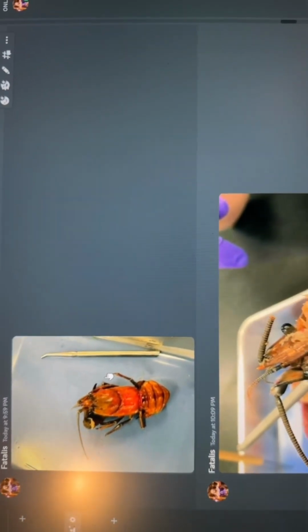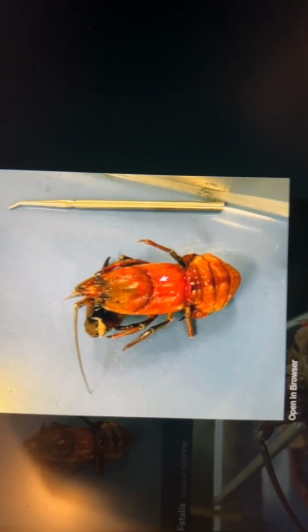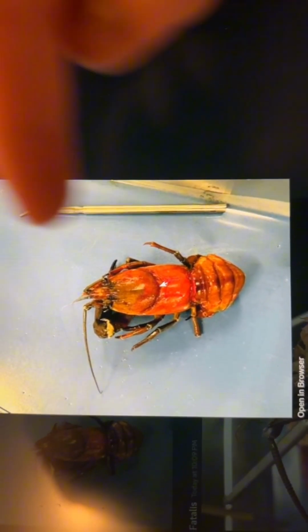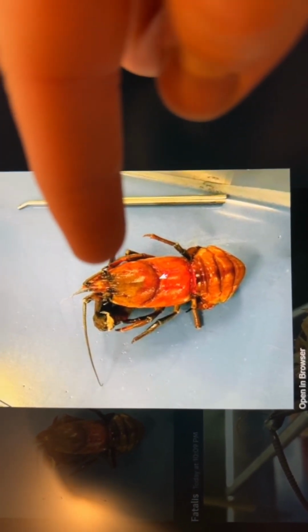So we're going to examine the crayfish first. One of the things that we're going to want to notice is this hard exoskeleton, and that's going to be present in our class of crustaceans and our phylum of arthropods. It's going to provide protection and support to the body, and we're going to notice that the top half of this body is a fused head and thorax, and we are seeing cephalization in this animal because we're seeing these important sensory organs like the antenna and the eyes, as well as mouth parts for feeding up here at the top.